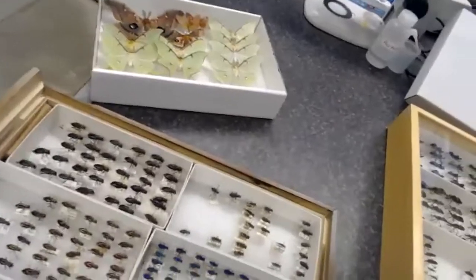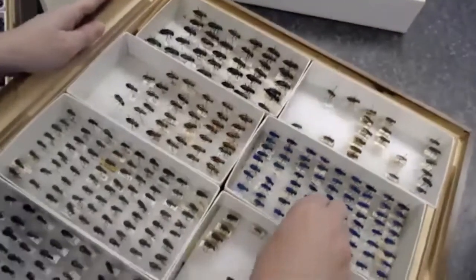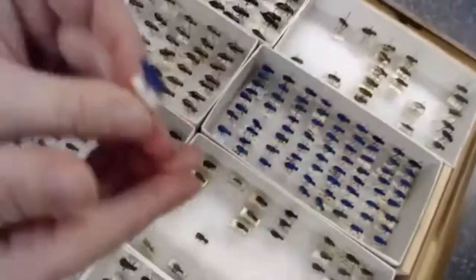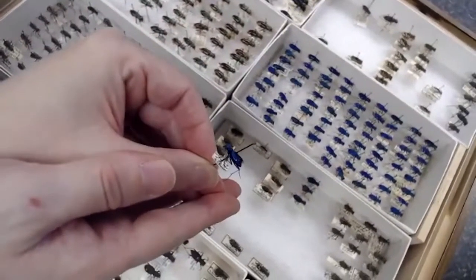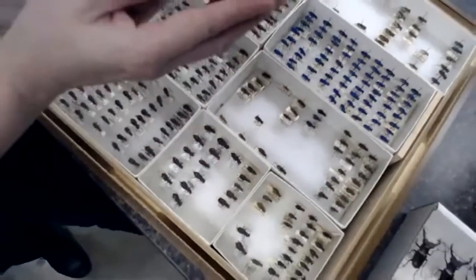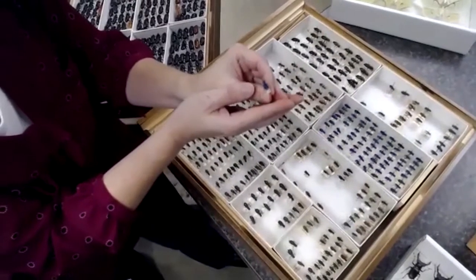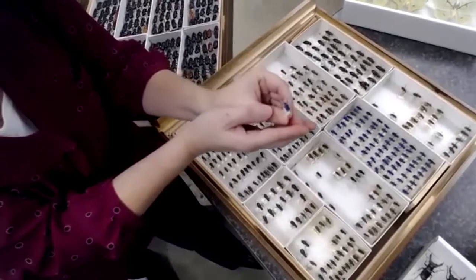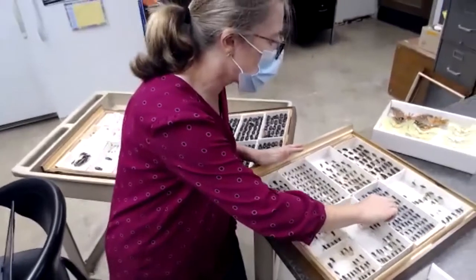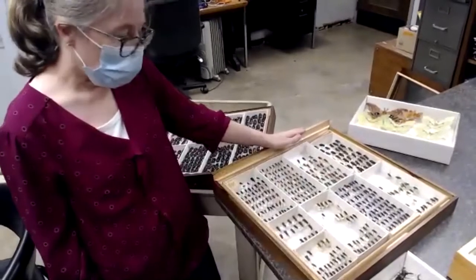And even after years and years of being in the collection, for example, if I pick this one up and look at the date, this is an insect that was collected in 1980. And it was collected by AC, I can't make that out. However, in Craighead, Arkansas. So here you can see how beautiful these tiger beetles, even after being in the collection for 40 years, are still perfectly preserved.